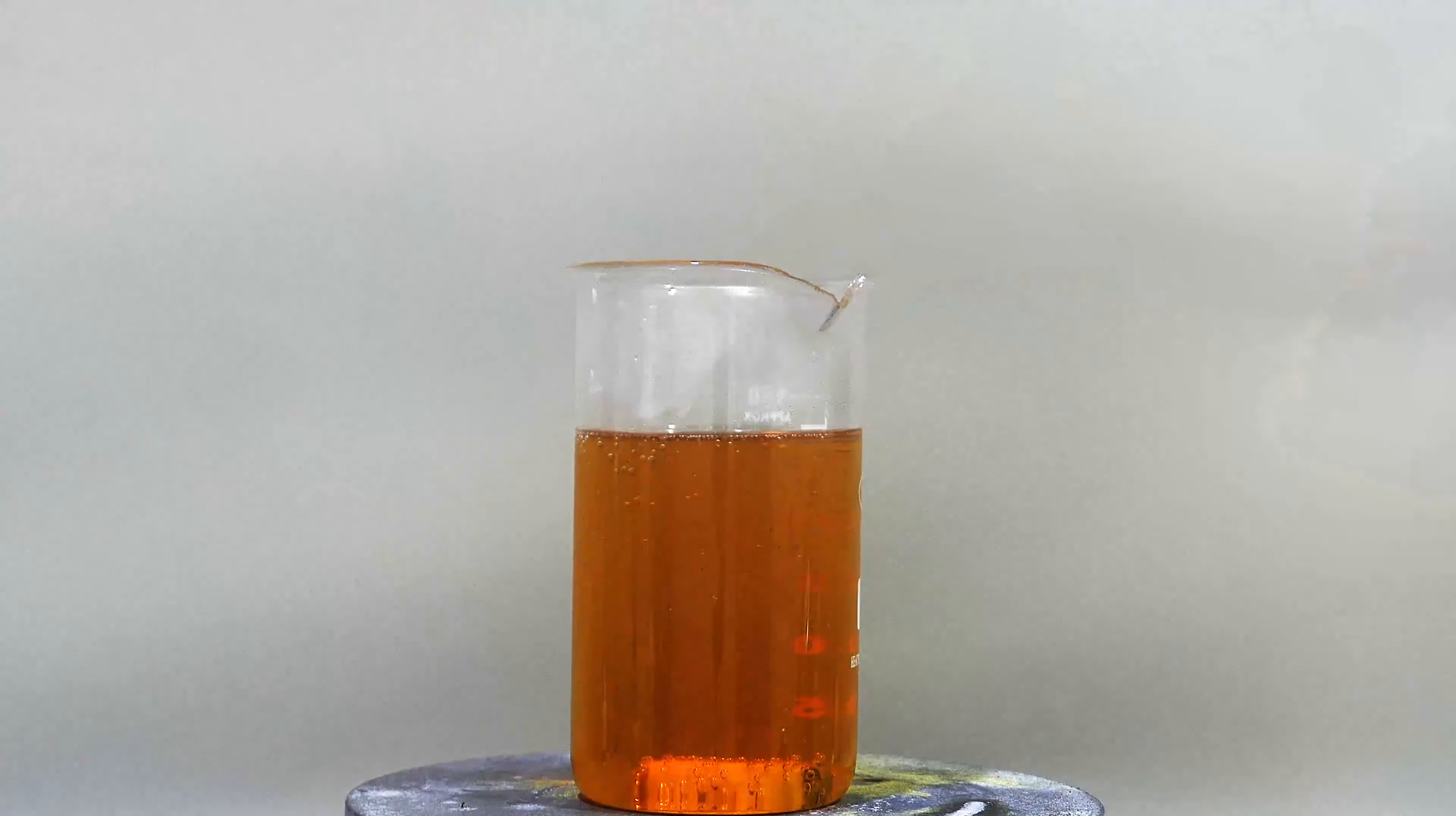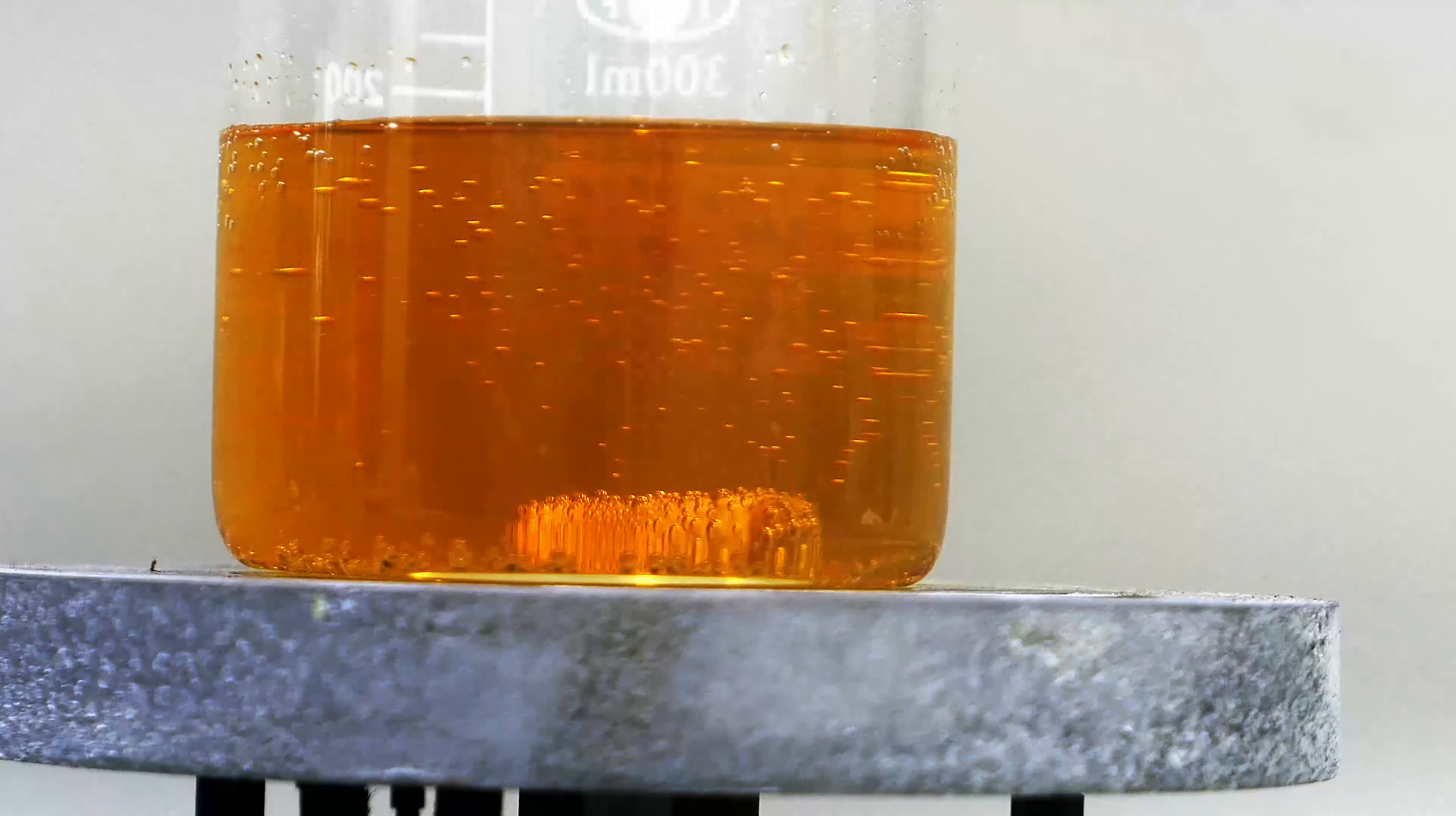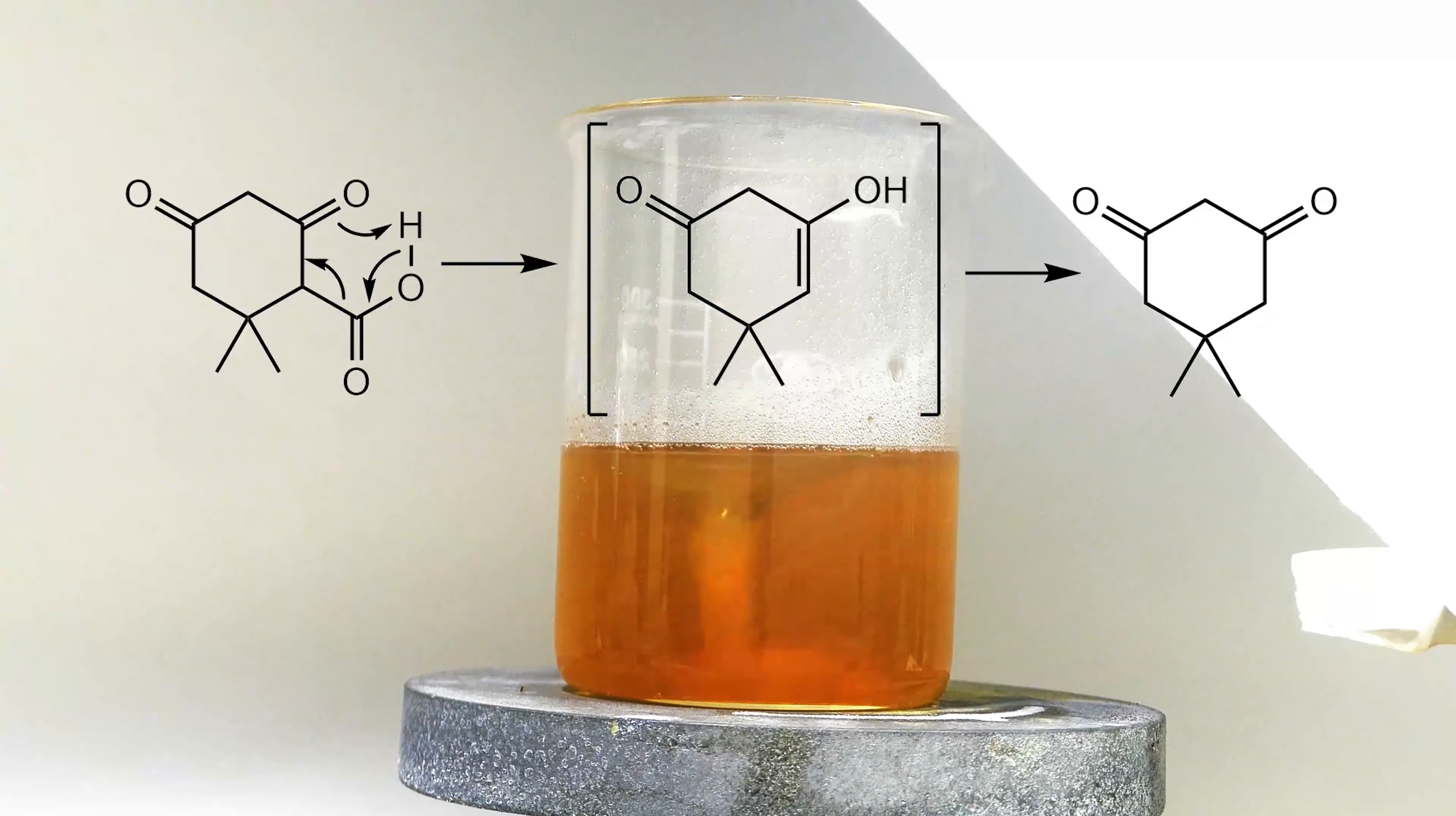I turned on the heating to boil the solution for 15 minutes. As the video shows, some bubbles are rising from the solution. These bubbles are actually carbon dioxide bubbles, indicating the decarboxylation reaction is occurring to yield our final product, dimedone.